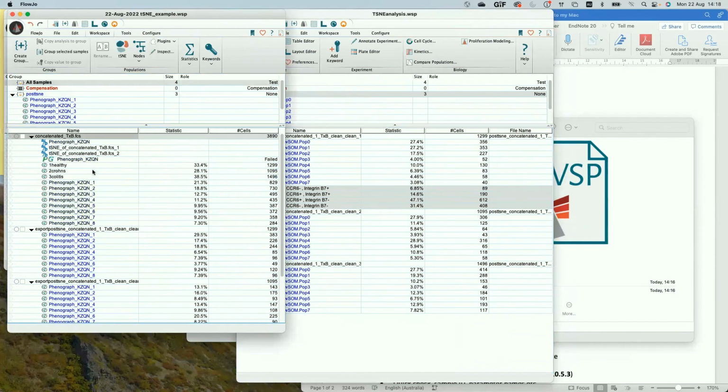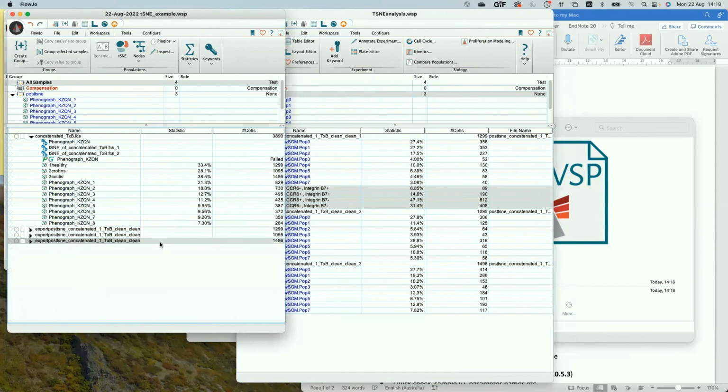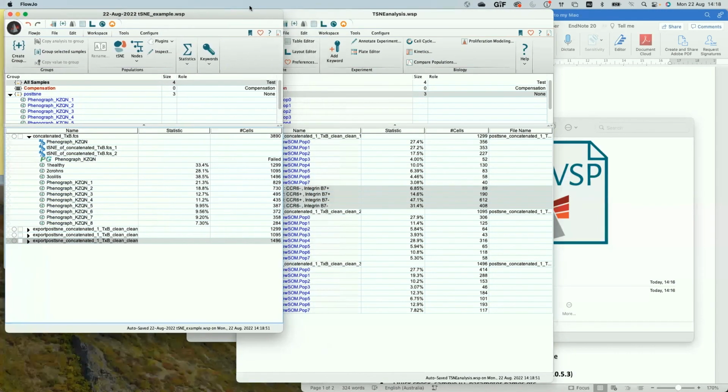Yeah, that's exactly what I do. Yeah, but something that I have also been aware of since doing the analysis of autofluorescent and stained samples is that sometimes these methods are more powerful, depending on the method you choose, than the traditional two-dimensional approach. So you can end up with populations that are slightly overlapping, but they are still distinct based on the analysis of the high dimensional reduction and the clustering analysis.